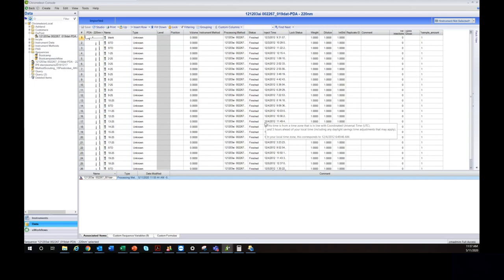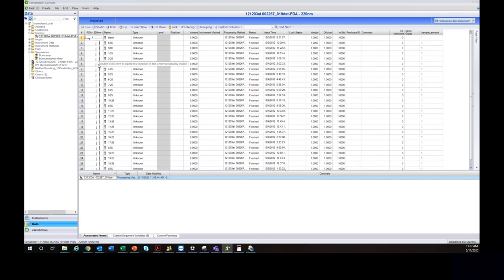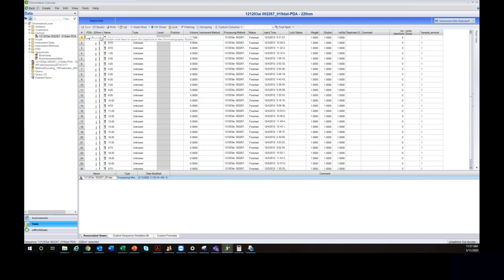Before we start integrating, let's talk about the injection list columns. The first column is the mini plot — a snapshot of your chromatography. Based on your view settings, you might only see the tops of a couple of peaks, but you can change those settings in the studio to show the whole chromatogram or just a critical pair. Next is the naming column — just the name of the injection, with up to 255 characters.